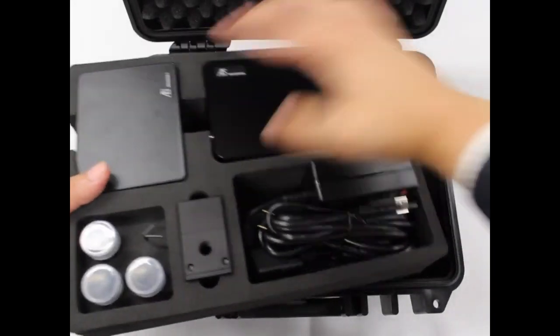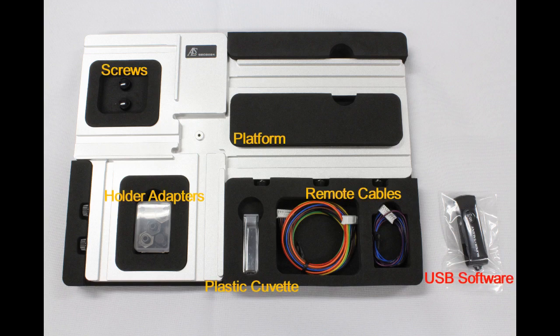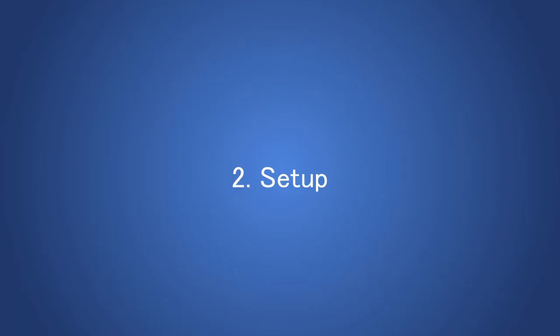In the second level, you will find the screws, platform, holder caps, remote cables, plastic cuvette, and USB memory which contains the software.